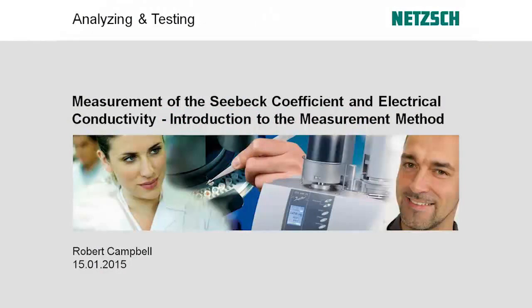Okay, the seminar today is going to cover the measurement of the Seebeck coefficient and electrical conductivity, introducing the measurement method.